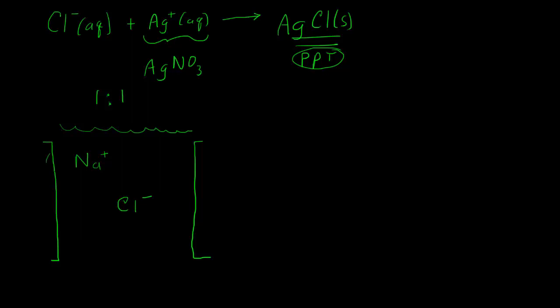Over here with this piece of metal, we're going to imagine that we pump electrons into it. That's going to charge this piece of metal up so that it has a negative charge. Over here, we're going to be pumping electrons out of this side of the piece of metal. If we're losing electrons, then it's going to build up a net positive charge. I'll draw little plus signs there for the positive charge.